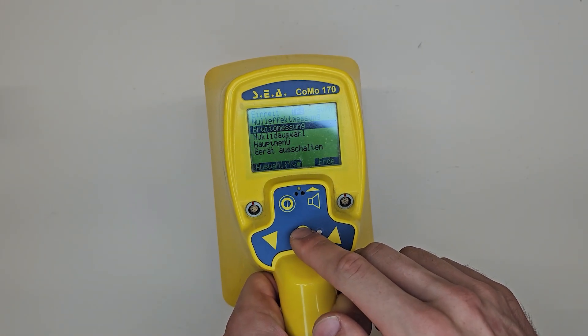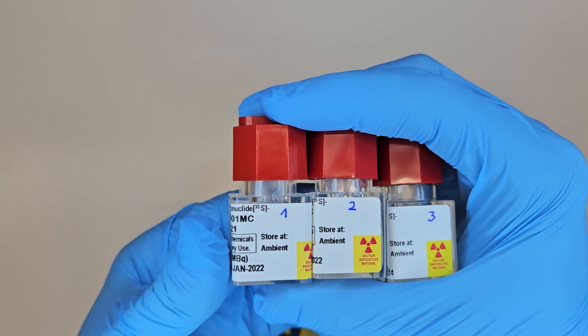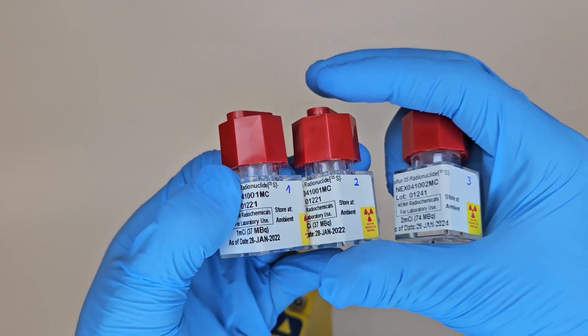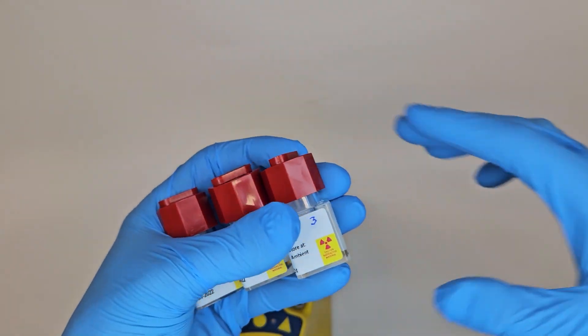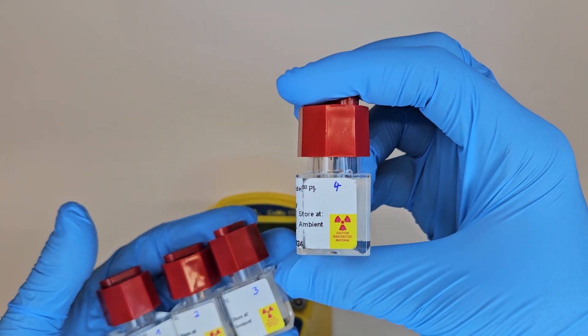That's all about the KOMO 170. I'll link the manufacturer's page in the video description — there are other versions of this device. Now I'll prepare some measurements to address the next comment. I'll take sample measurements of all our beta-only emitters using the most accurate and by far the most expensive one, the KOMO 170D.